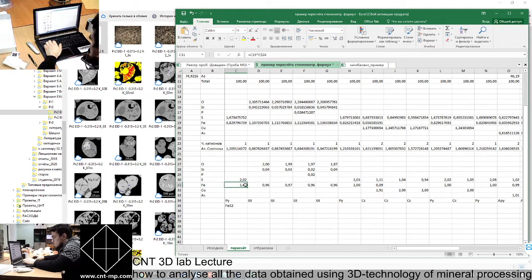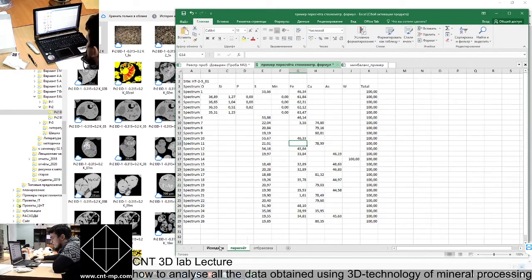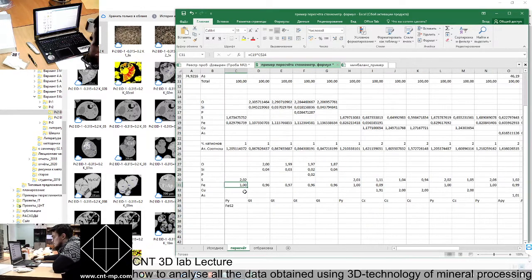You see, iron is 1, that's because we counted for one cation, and actually in pyrite there is one cation made of iron, and a little bit more sulfur. That's what I'm talking about when you analyze the normalized analysis. You always will receive some displacement in your results. I mean, some of the cations would be less or more, and the same for anions.